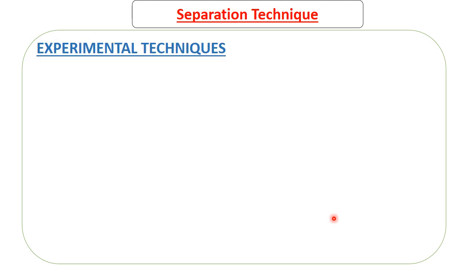Hey guys, so in this video we're going to take a look at experimental techniques. So these are just some of the skills or some knowledge that you need to know about how experiments in the lab are done. So we're going to start with measuring tools. How do we measure different things in the lab?